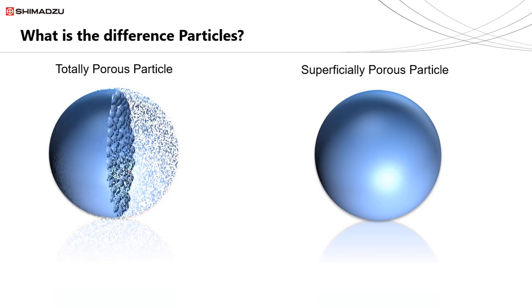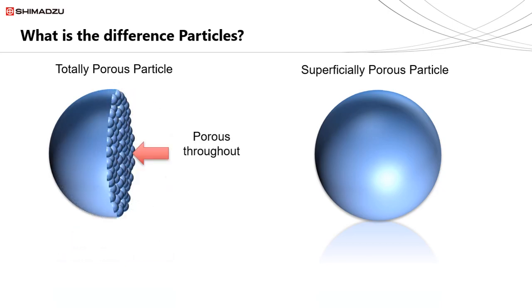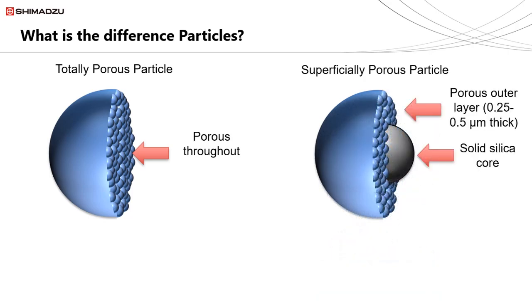When choosing the particle size, we also have the possibility of increasing efficiency using superficially porous particles. The introduction of superficially porous particles allowed development of UHPLC methods using lower pressure rated instruments. This practice is still used by many people today.